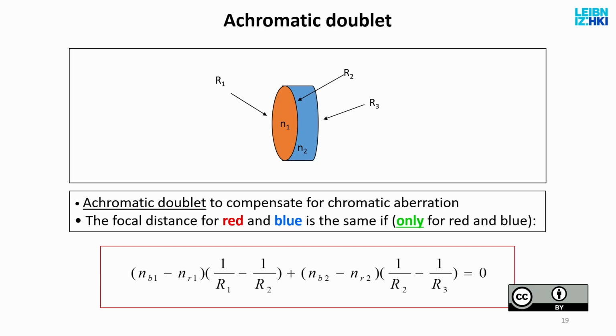So when you look at your microscope lens, which you paid, I don't know, 10,000 to 15,000 euros for, we'll talk about these markings on the objective lens. It will have a marking which will say, okay, if you look it up on the internet, let's say it's compensated for 600 nanometers and 400 nanometers. But anything in between will still have a different focal point.